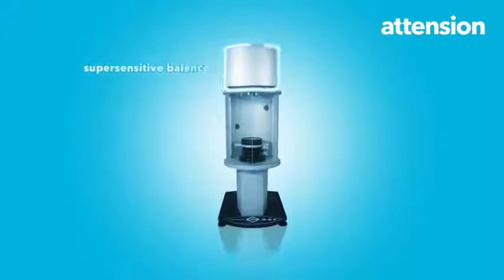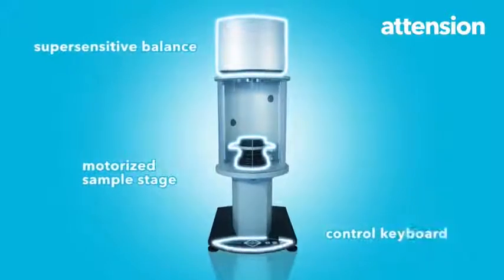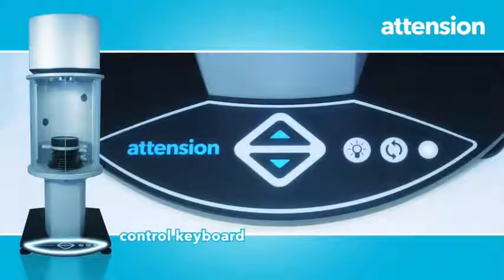Sigma Force Tensiometer is equipped with a supersensitive balance, a motorized sample stage and a control keyboard. The keyboard allows quick and convenient control during and between experiments.